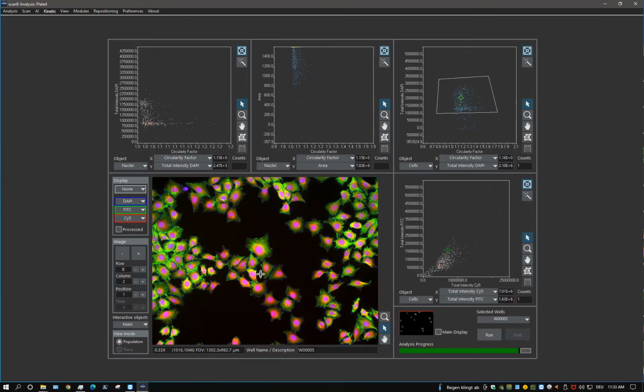Okay, and with this I would like to finish the presentation of the software side and finish this workshop with a short glimpse on other examples to show a little bit more the broadness where the pre-trained networks can be applied. Okay, just a selection of examples.